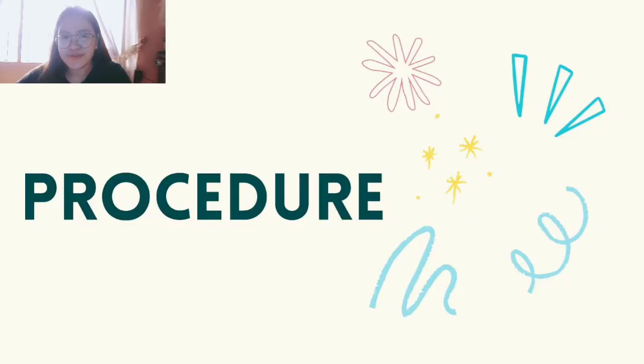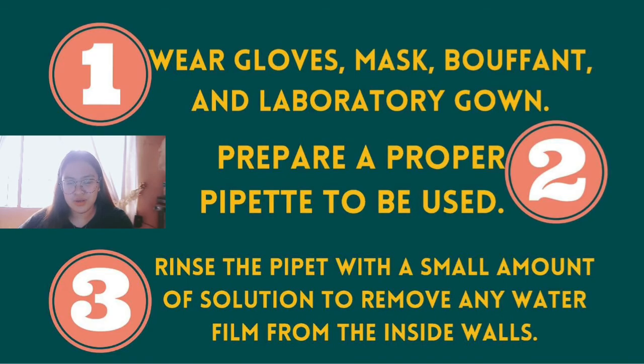Okay, so let's proceed with our procedure on how to properly use a pipette in a laboratory. Our first step is to wear gloves, mask, bouffant, and laboratory gown. And PPE: always remember that PPE is almost always necessary to protect workers from chemical exposures and other hazards.